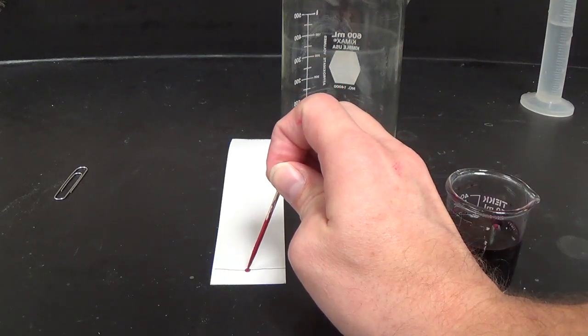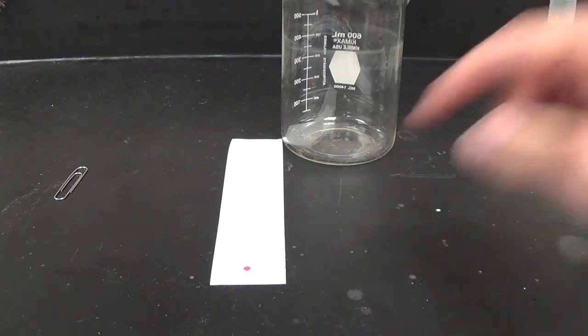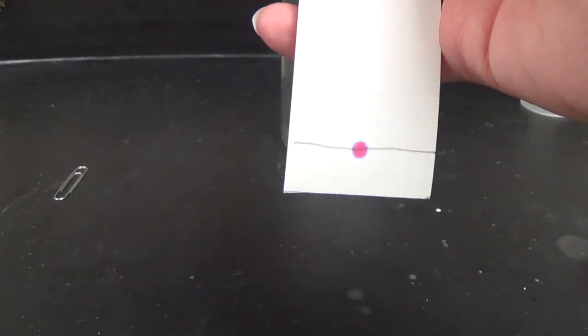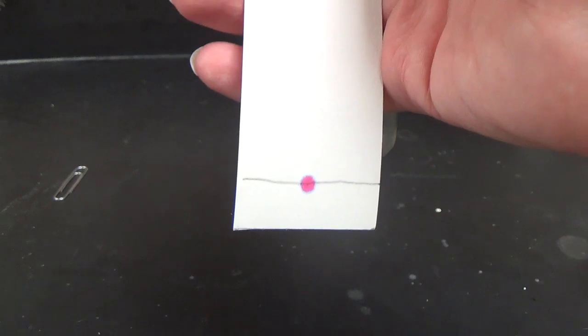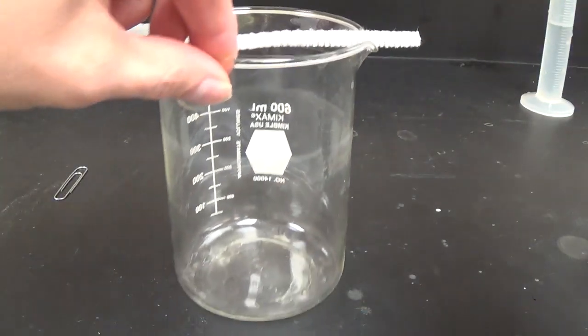So notice I'm not tapping for long, but I wanted to try and get that 2-layer going on. So I got a good amount of purple stuff. You can see the purple stuff on my starting mark there. All right. Now that I've got the purple on my starting mark, I'm going to size it up for the beaker.